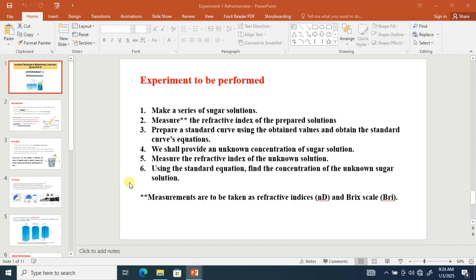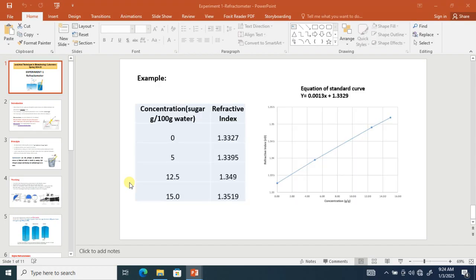And this is basically a standard curve. What is a standard curve? Standard curve means, suppose we already have known concentrations of solutions. Let's say we have 5 samples, A, B, C, D, E. We already know what the concentrations are. So a standard curve is basically a plot which helps us to determine the unknown concentration of any sample using the formula we all know, y equal to mx plus c, where m is the slope, c is the intercept, x is the x-axis value and y is the y-axis value. So wherever you go in any practical, you will see that the standard curve is a very important phenomenon. We will use that concept to measure the unknown concentration.